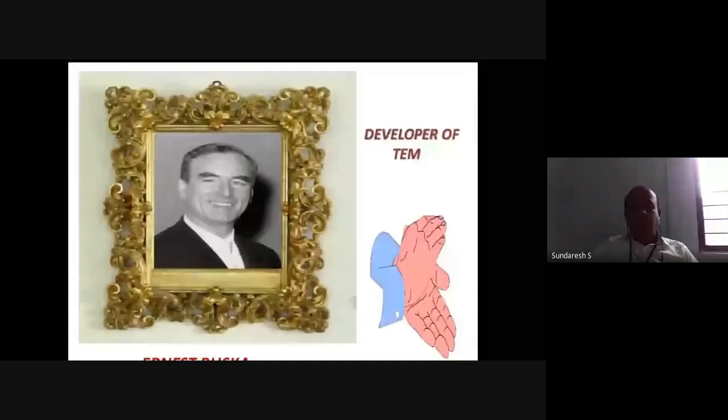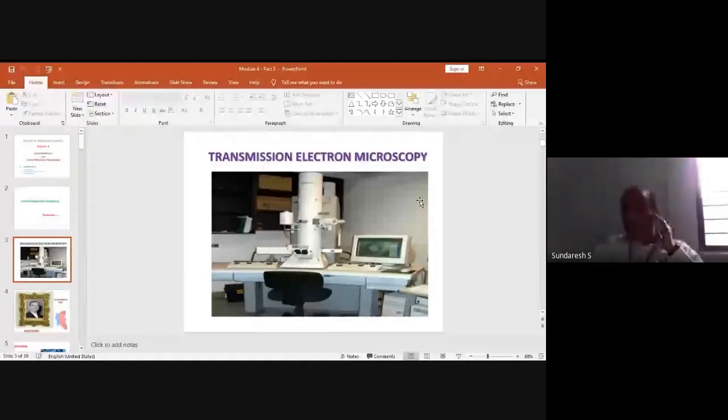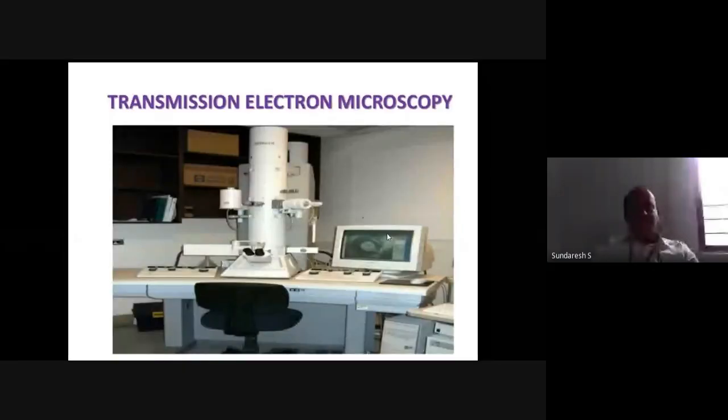What we call the transmission electron microscopy. In this, we need to discuss what is the basic principle behind this transmission electron microscopy, and then we need to discuss what the imaging modes are, and also how we can use this transmission microscopy in different applications.